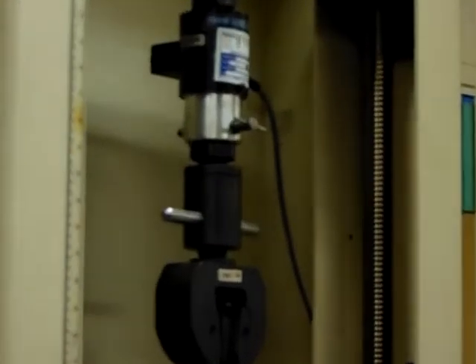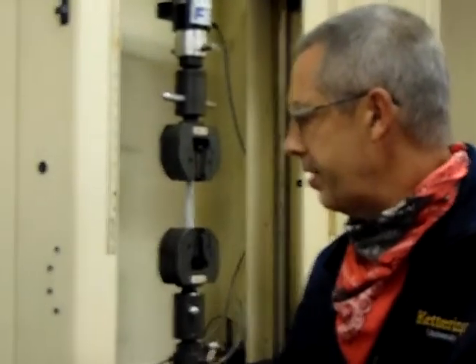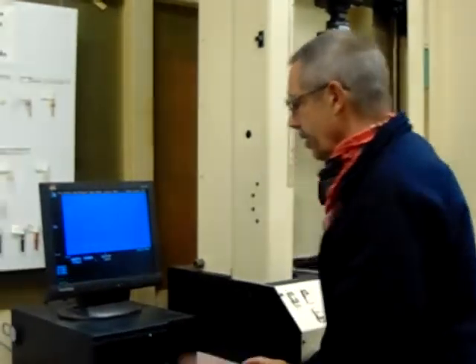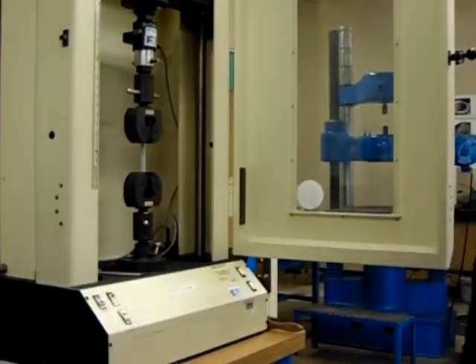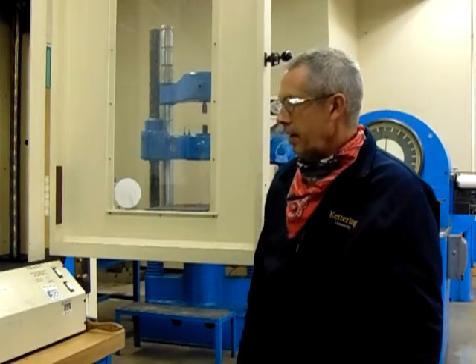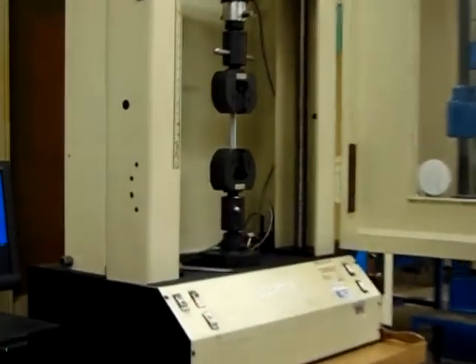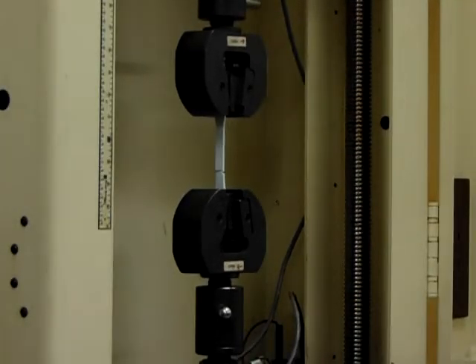Now once the sample is in there, we just do a couple clicks. We're going to click on test and we're ready to go to the specimen. We're going to push the letter T and test it to failure. Glad to see everybody has their safety glasses on. We're up to a load of 300, 350, 400 — and there we go, our sample broke.